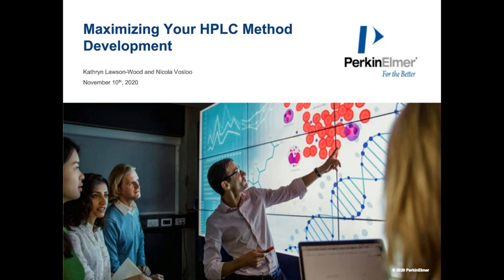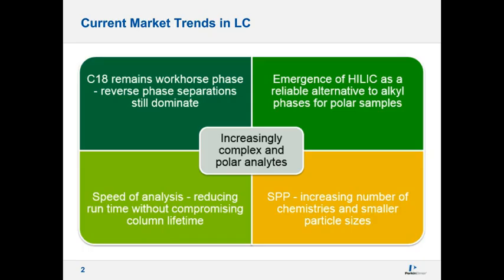The majority of HPLC analyses are performed in reverse phase mode. The C18 is still the workhorse for many applications, but its dominance has reduced as the complexity of samples has increased, and also with increasing polarity. It has broad applicability for pharmaceutical, food, and environmental analyses. However, C18 columns cannot be used for everything, and is the reason for phases with orthogonal selectivities.